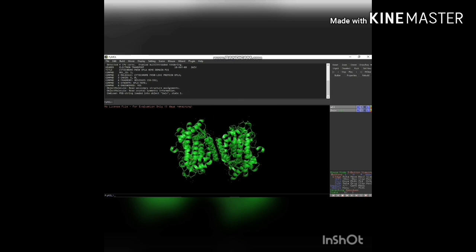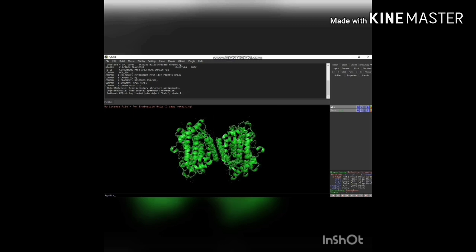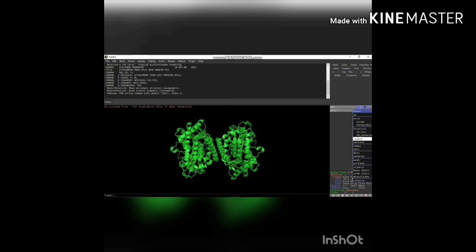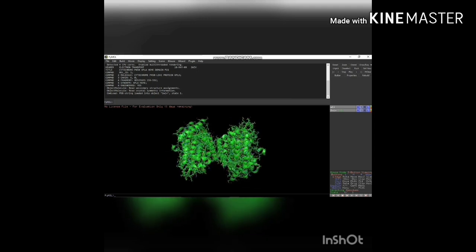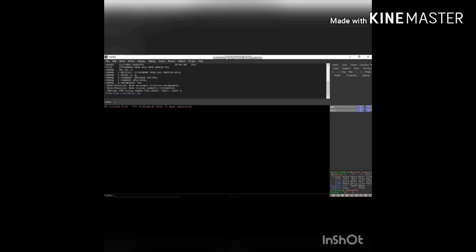Then you can click the show option. It will show many models like ribbon, sticks, and cartoons. You can use whichever model you want. If you click the sticks model it will show sticks, so the structure is a mix of ribbon, sticks, and cartoon models. I prefer to use the cartoon model, so give the command: hide everything, all — the structure will be hidden.